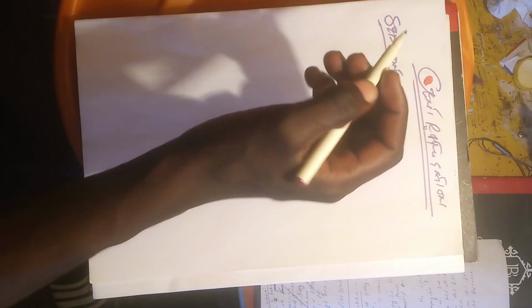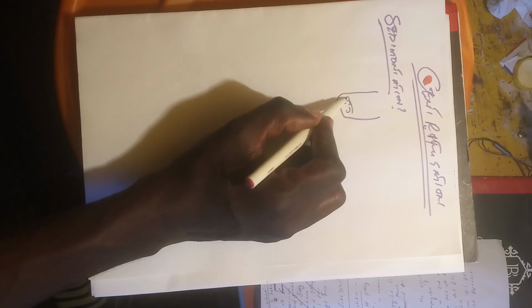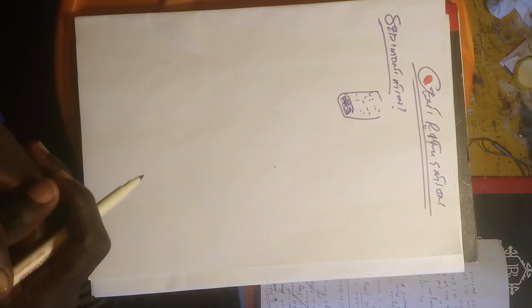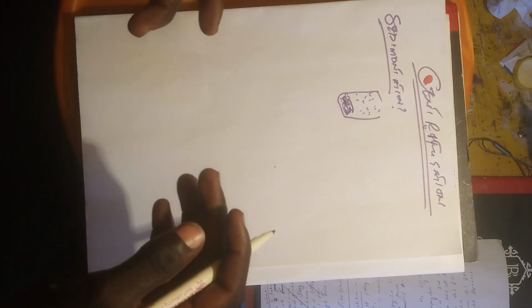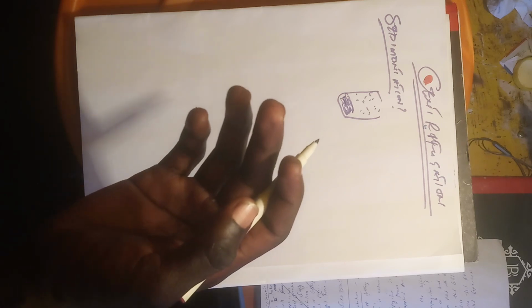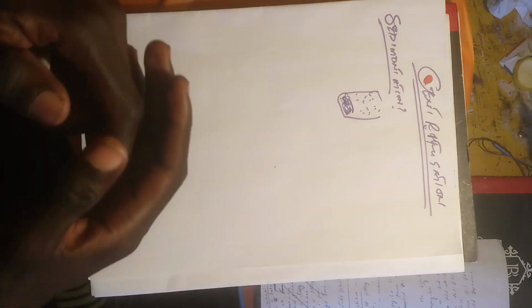Think of a mixture of sand and water. You mix sand and water, then you just put them there to settle. After an hour or two, you will notice that the sand particles, which are solid, will settle at the bottom, and then you have the liquid part, which is the water, on top, and that is called sedimentation. But remember, I mentioned something like after an hour or two, so this takes a long time. It consumes time, so we need these types of separations to be faster than this.